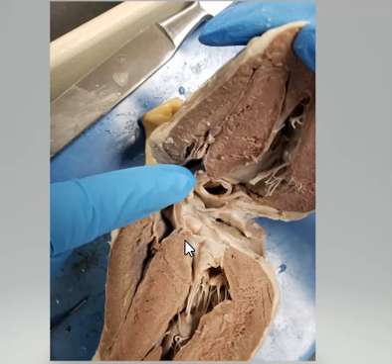One of the reasons I took this picture, though, you can see my finger pointing, is I believe we have an intact aortic semilunar valve. Why do I say aortic semilunar? Because when you put this heart over to this side, you can see that this appears to be coming out of this left ventricle, the top of the left ventricle. So aortic semilunar valve giving rise to the aorta.